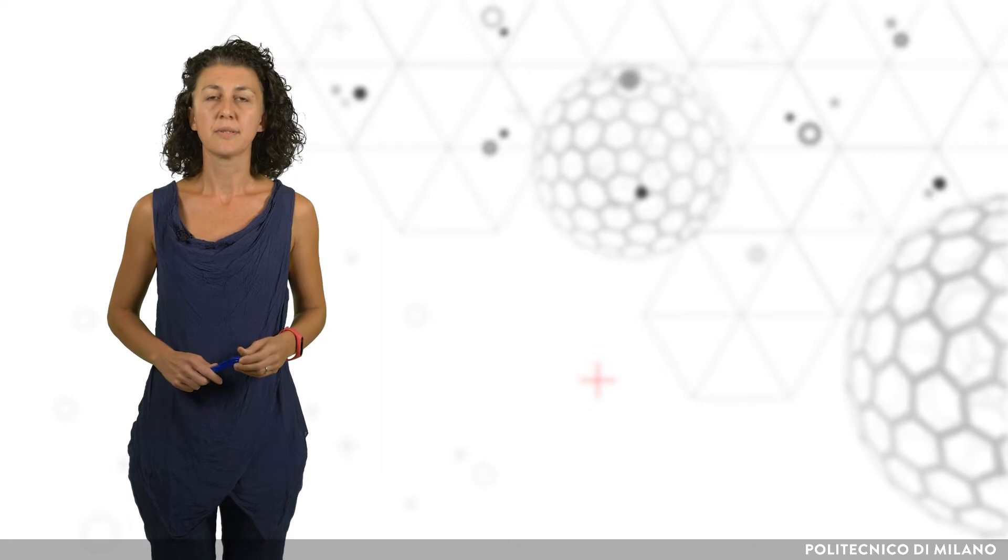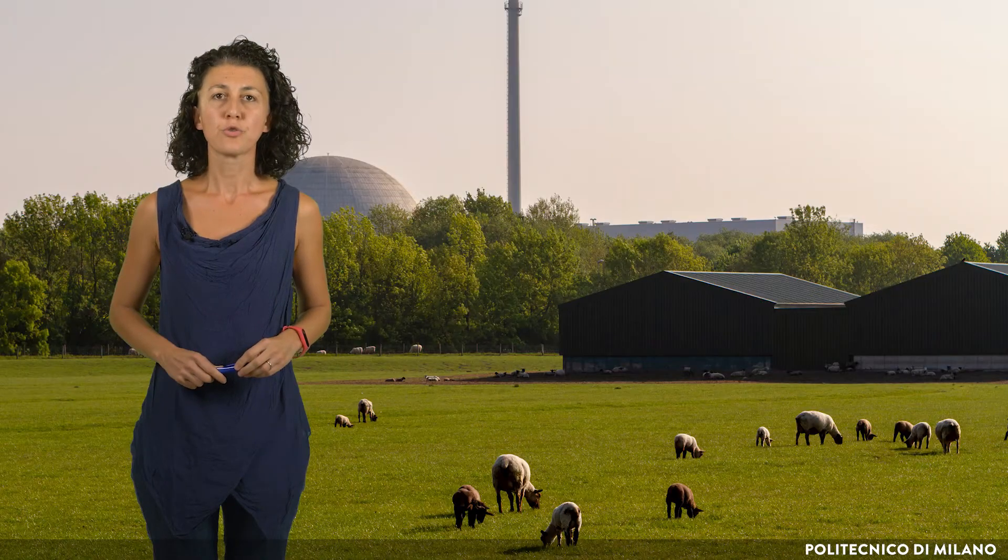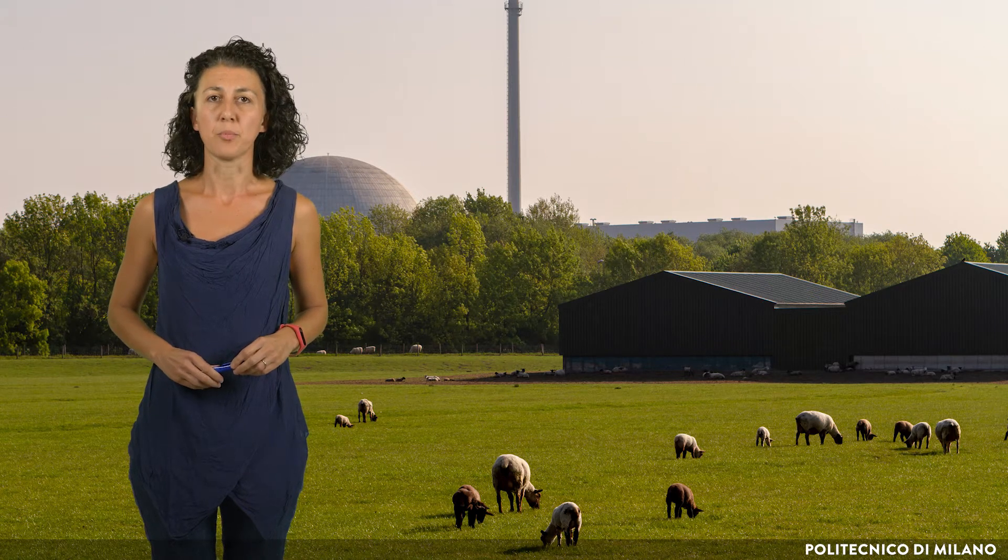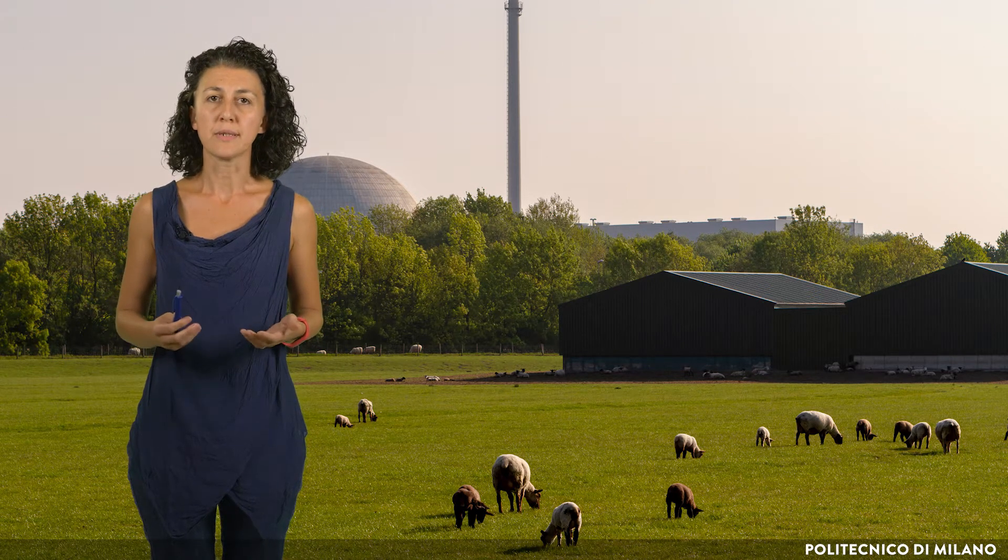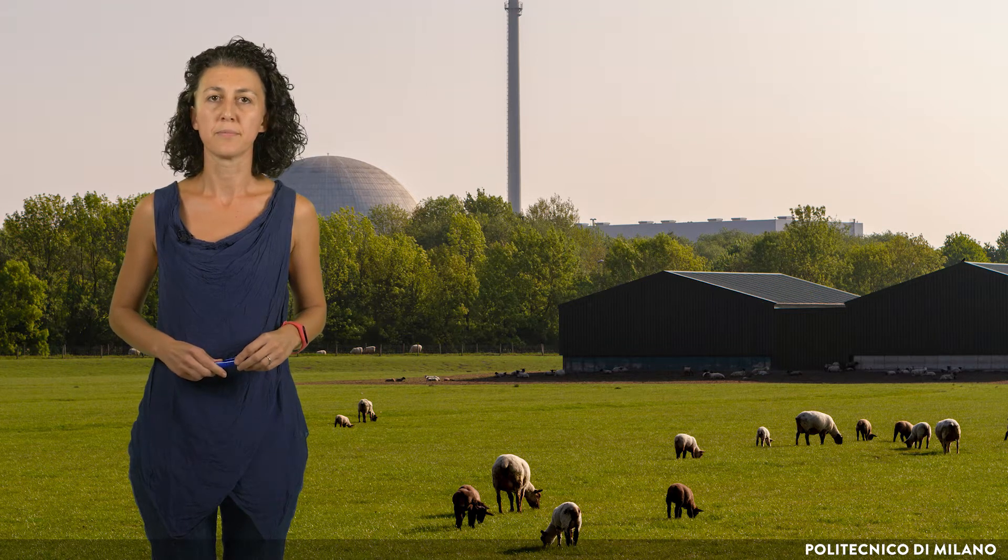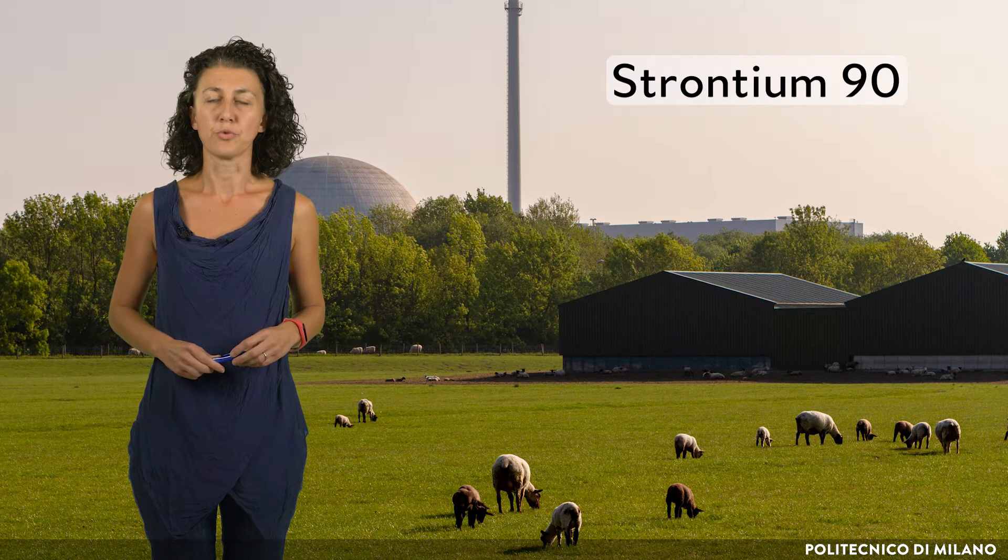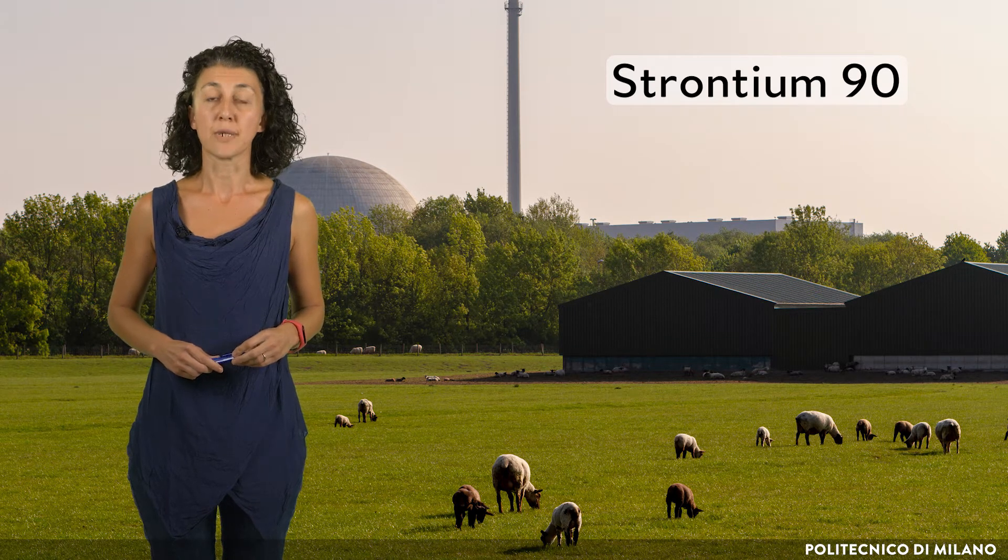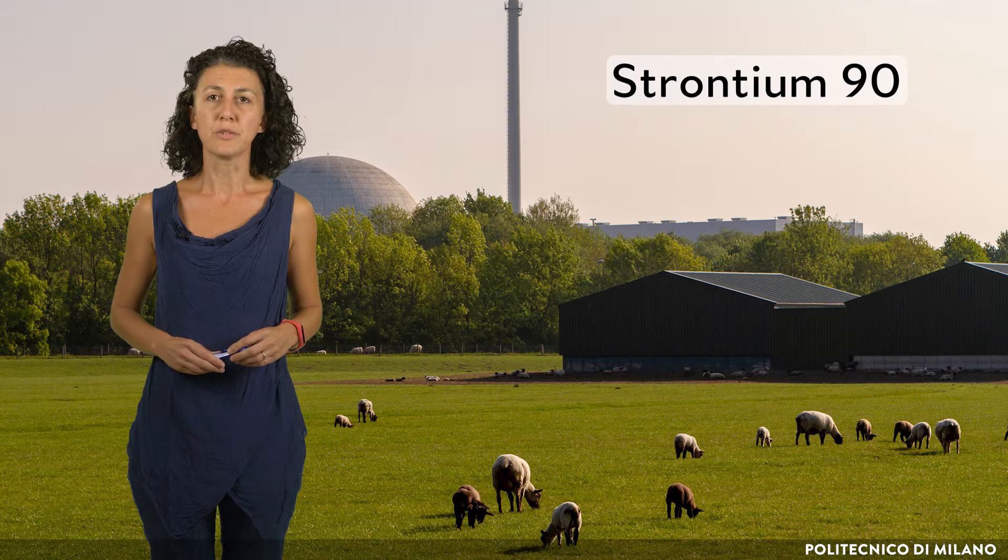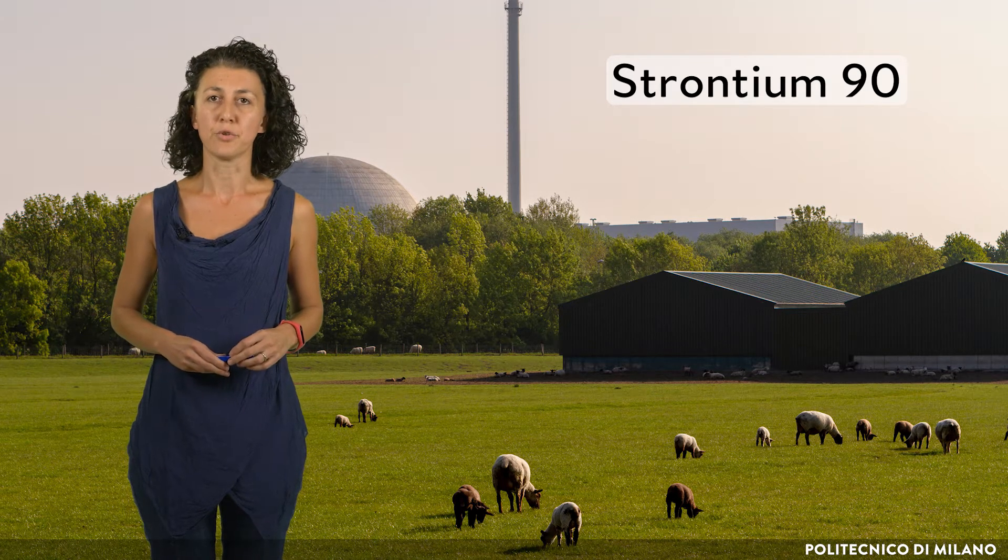Let's consider now the determination of artificial radiostrontium in milk. Strontium presence in environmental samples or food is a good indicator of radioactive contamination from a nuclear power plant. Indeed, strontium-90 is an isotope of concern in fallout from nuclear accidents, but also in monitoring the areas surrounding a nuclear power plant, even if not working.